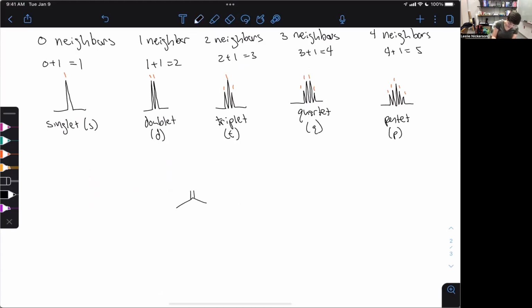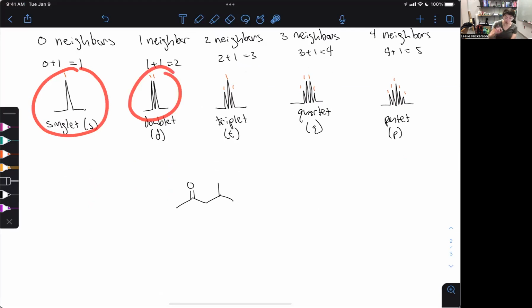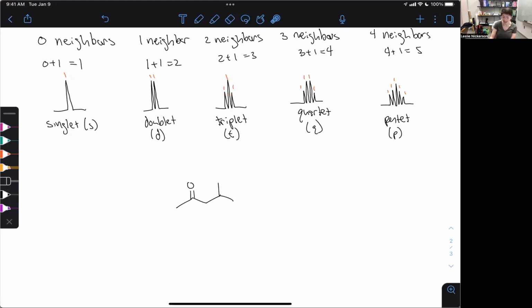And the really cool thing about these splittings is that it actually comes from Pascal's, or Fibonacci's, triangle in terms of what the shape of the peaks are, where you've got 1, and then 1, 1 of equal size, and then 1, 2, 1, where this is about twice the size of the little ones. So that's kind of how these got developed. It's pretty neat though. Math is fun. All right, I'm getting off track here.